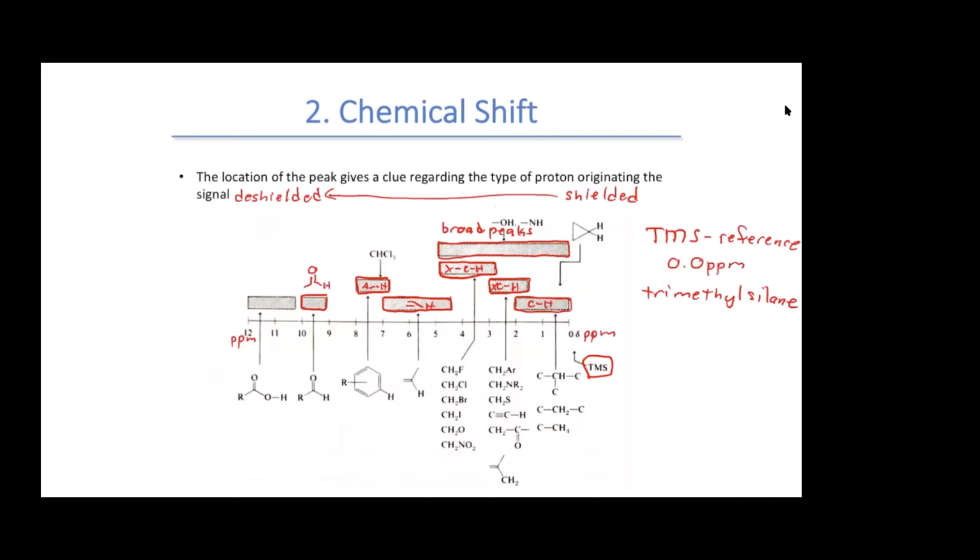You can see the aldehyde H acts differently than our alkene hydrogens. It's much more deshielded because of that oxygen present. And then finally, our most deshielded protons are carboxylic acids. The carboxylic acid OH tends to show up as a very small, very broad peak. Sometimes it is so broad that it's very hard to see in the NMR spectra, but the machine will integrate something in this region for you, and then you can tell you have a carboxylic acid OH.